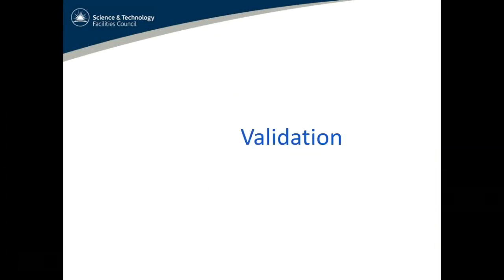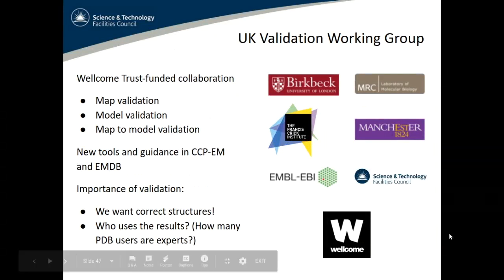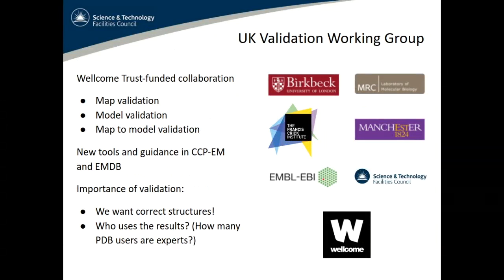Moving on to the final stage, after you've got your model built, you then would like to validate it. I'll just mention as a side here that CCP-EM is involved in this UK validation working group, so this is a collaboration of 6 sites looking at EM validation problems. And the aim is to produce new tools and guidance which will end up being distributed through CCP-EM as well as available through the EMDB web interface.